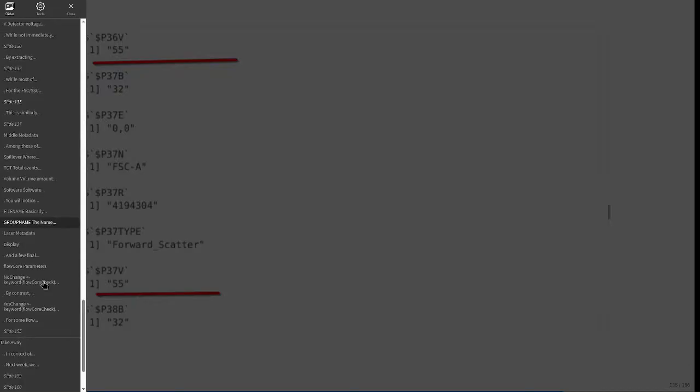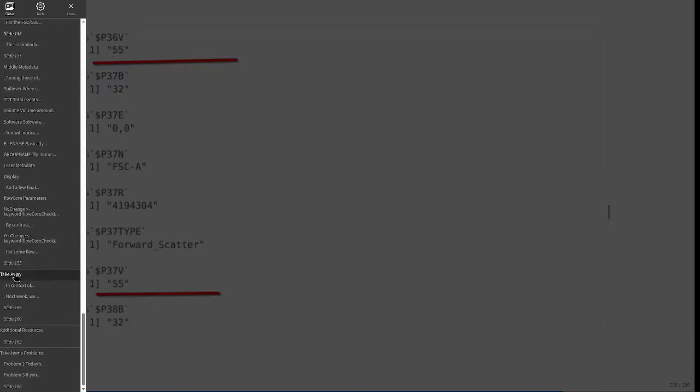Let me not go scrolling all the way down. Let me go back down to takeaway. There we go. All right.